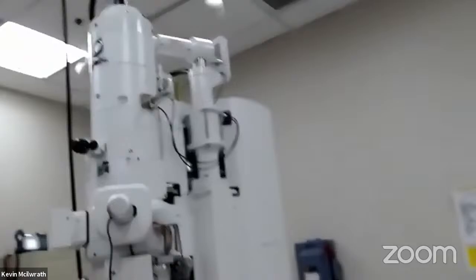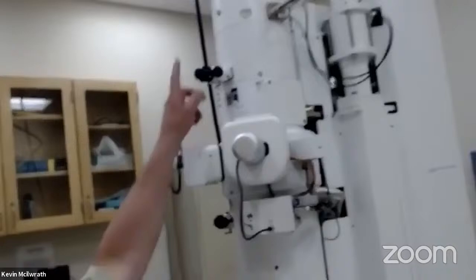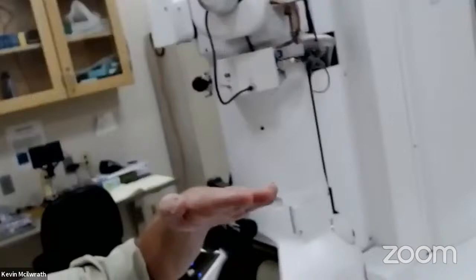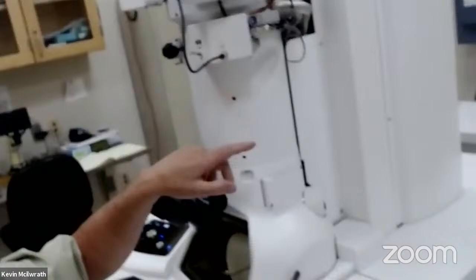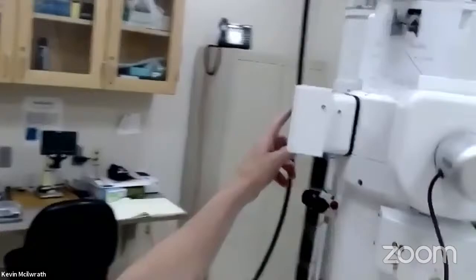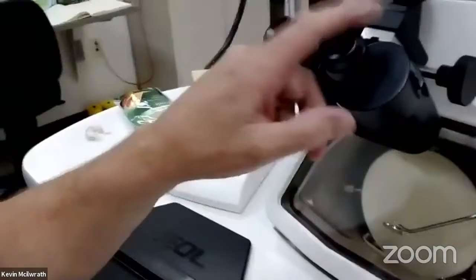So like I said, I'm in the microscope room and here's the microscope. The door back there has pumps and water chiller and things. Over here, we have our condenser aperture, our TEM stage. I've got a double tilt holder here with a motor that tilts the sample in this direction because the stage only goes in this direction. And then there's a connector for the motor to give it power. Then we have our diffraction aperture, and our objective lens. We have a viewing chamber with binoculars. I don't use these anymore, really.